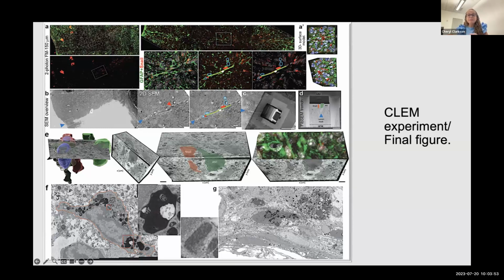So in this case, I use FIB-SEM. I didn't want to go deeper because I have to stop, and after that, just go into the Helios and find my region of interest, as you can see here. So I still have the lesion track here. And do you remember the very flat cell? I have it in here. I have my 4 blood vessels in there, and I have at the top here, highlighted with this arrowhead in red, my target cell. So as you can see, I use all my fiducial points, and it's super important.